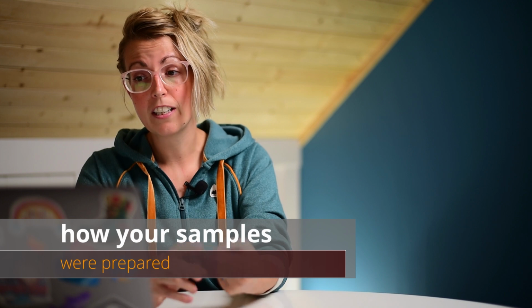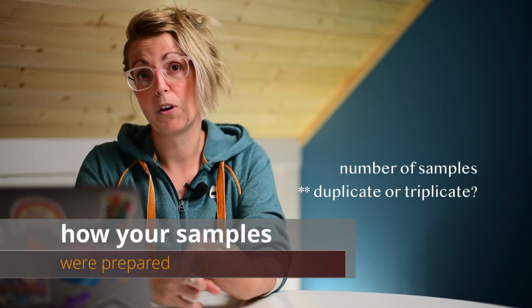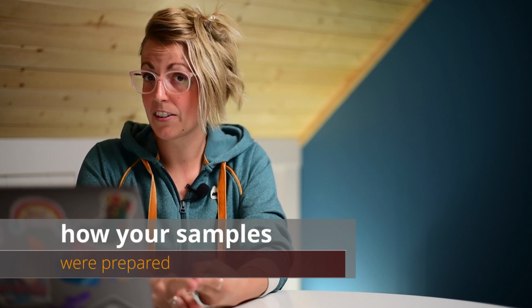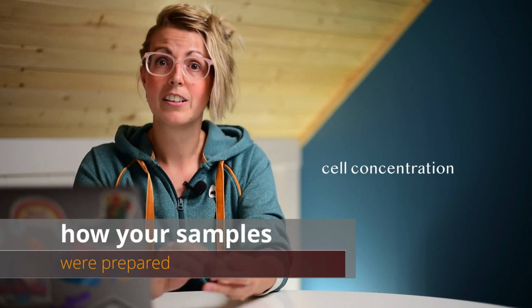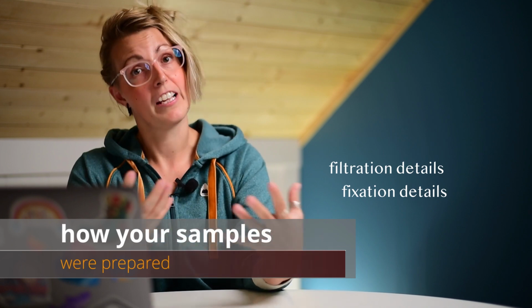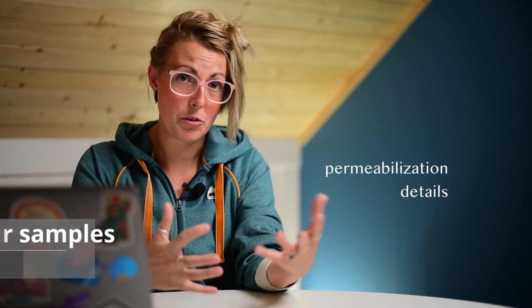So this includes the number of independent experiments and the number of samples, whether you've done them in duplicate or triplicate, details on how the samples were prepared, so things like the buffer you used, the cell concentration, proteases if you added them, if you filtered your sample, if you fixed your samples and what reagents you used, if you permeabilized, what reagents you used. So anything that touches your cells, you should have enough detail in the buffer information in your methods that somebody could go and make that exact buffer.